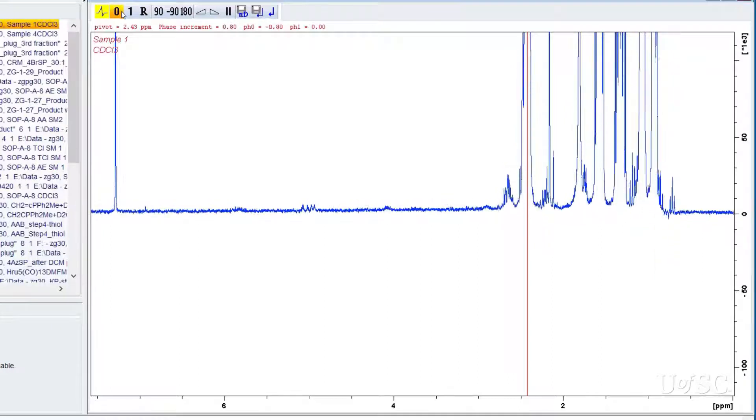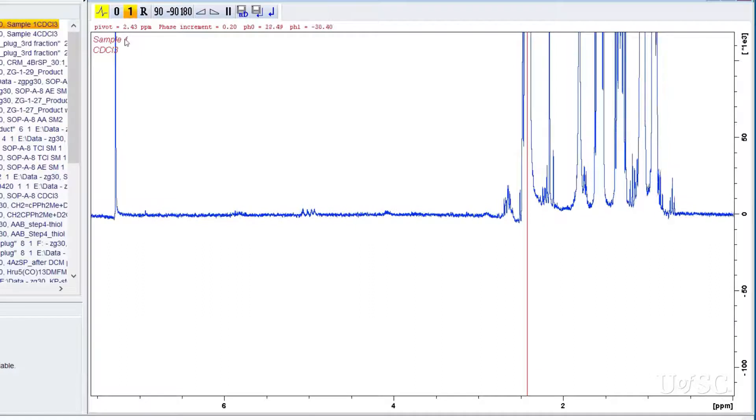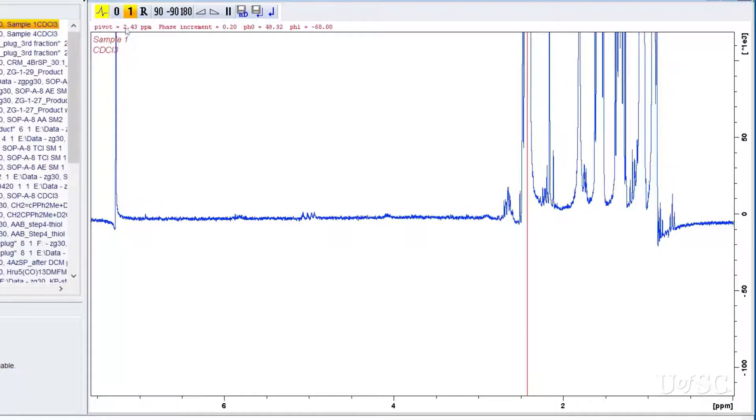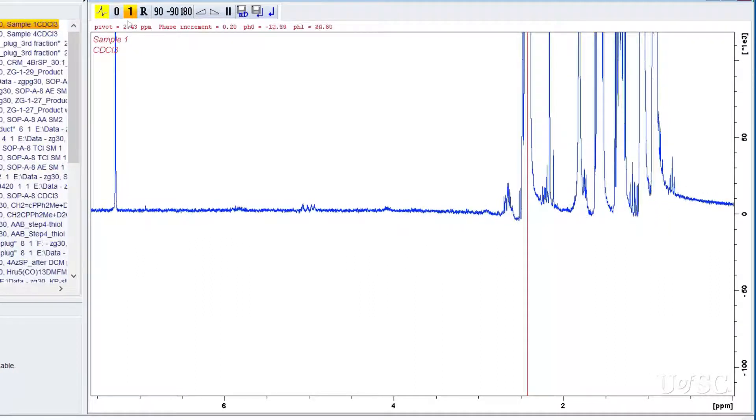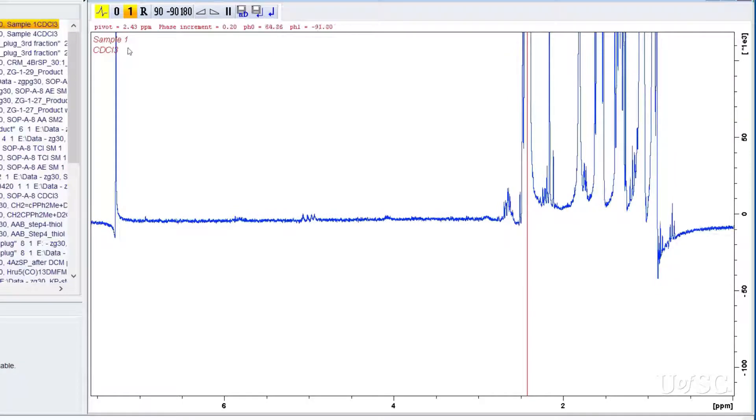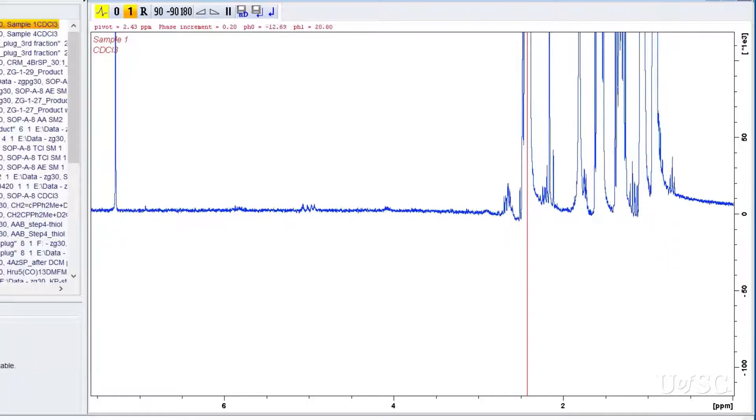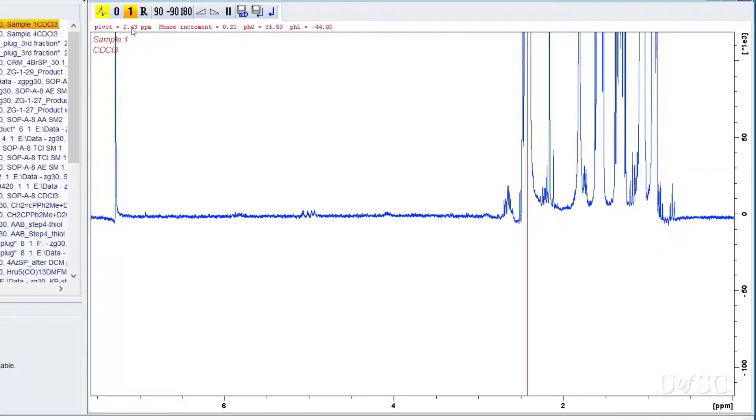By clicking and holding the one button you can make first order phase corrections by moving the mouse up or down. This adjustment makes changes that are greater further away from the pivot point. In other words it is a frequency dependent correction.